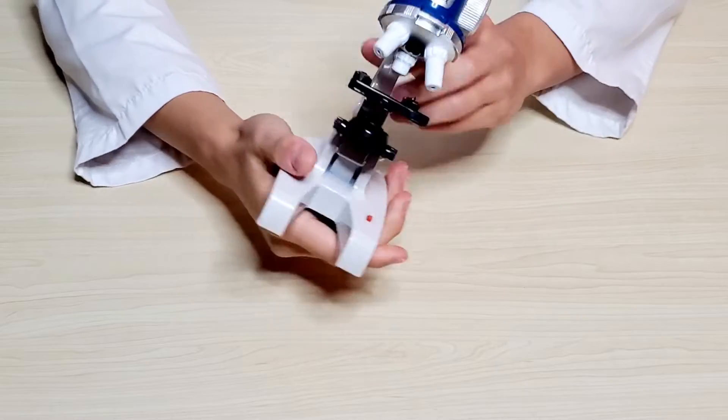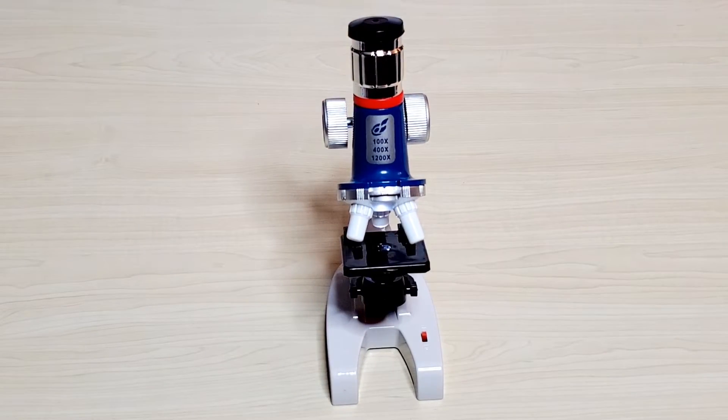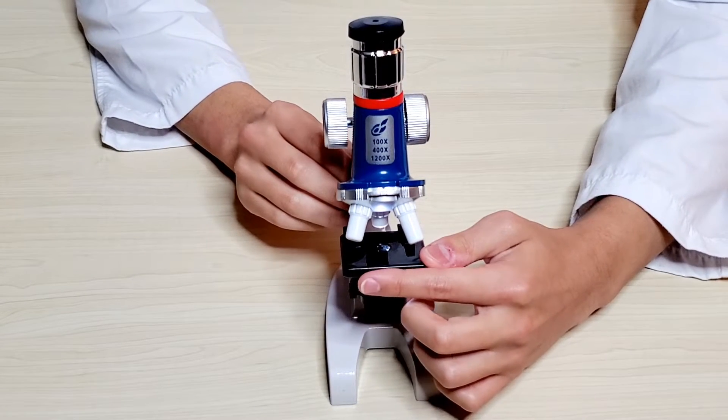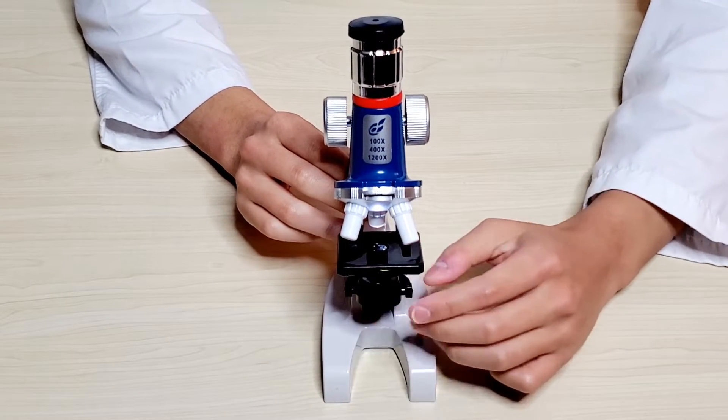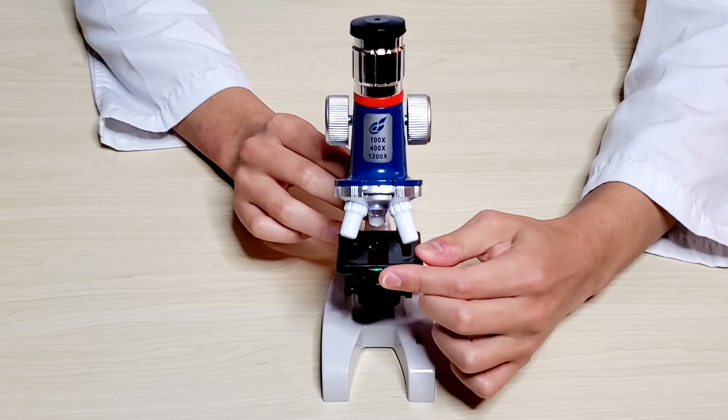Now that's done, let's check if it works. As you can see, there's a filter here. The light right now is just white but you can move it to change the colors of the light.